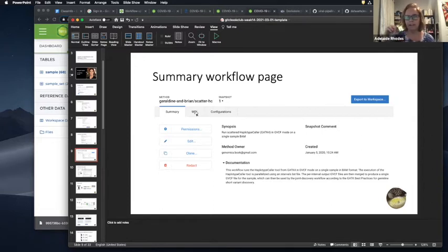I have a demo where I'm going to show you where I stepped through the WDL to find the files that I need to change, which are in a Docker that are linked to a GitHub. So if I want to recreate this workflow, but then have my adjustments to it, it's really good to understand how to navigate these workspaces. And that could be a little confusing if you're not real familiar with Terra.